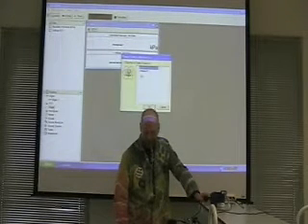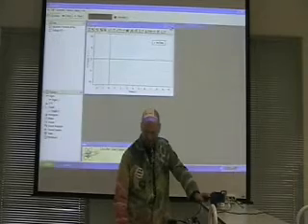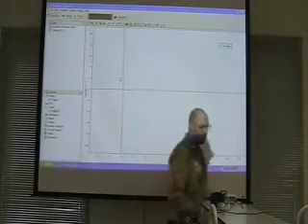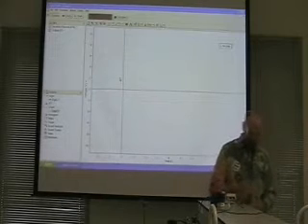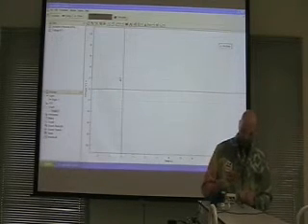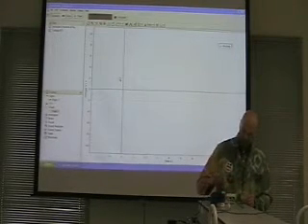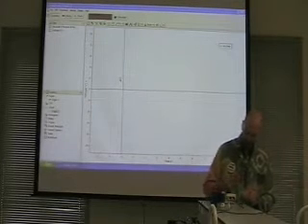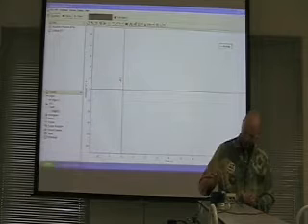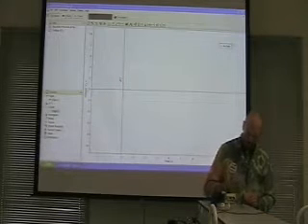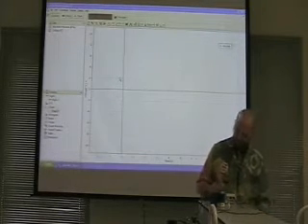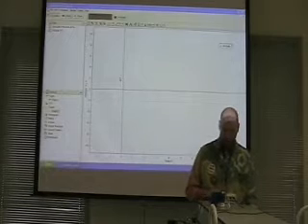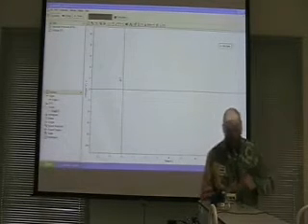Alright. Now, again, I want a graph of voltage over time. Now once again, we have to tell GLX what zero is. Or excuse me, the colorimeter what zero is. So we press R, we've got zero.